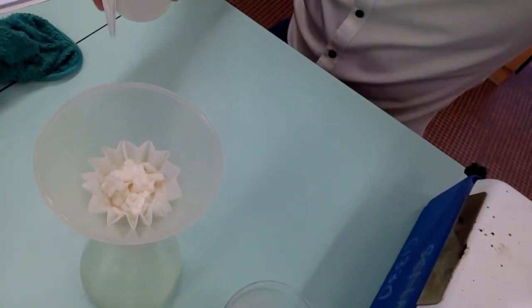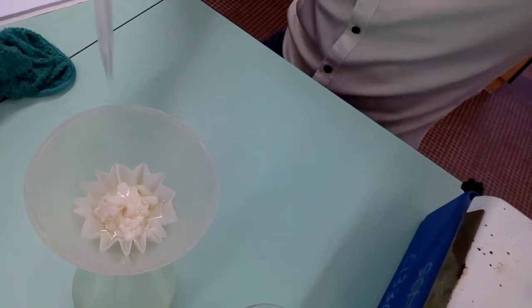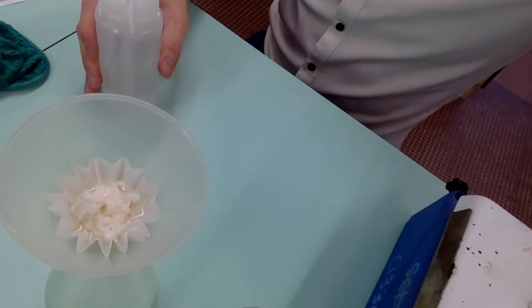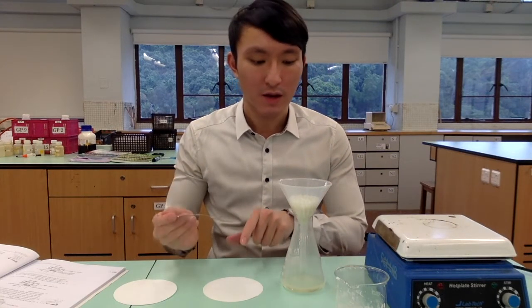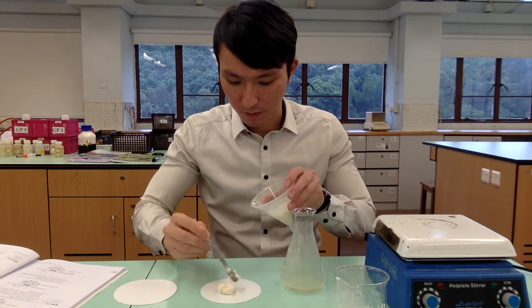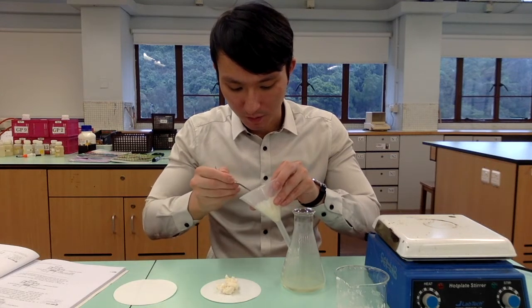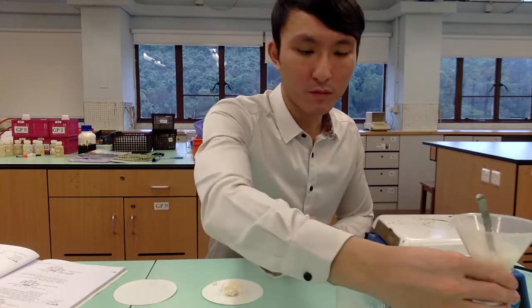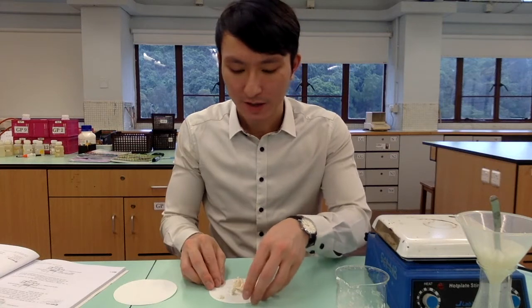Use a small amount of distilled water to rinse the surface of the white solid. Now, transfer the solid onto a filter paper. Dry the soap by pressing against the filter paper.